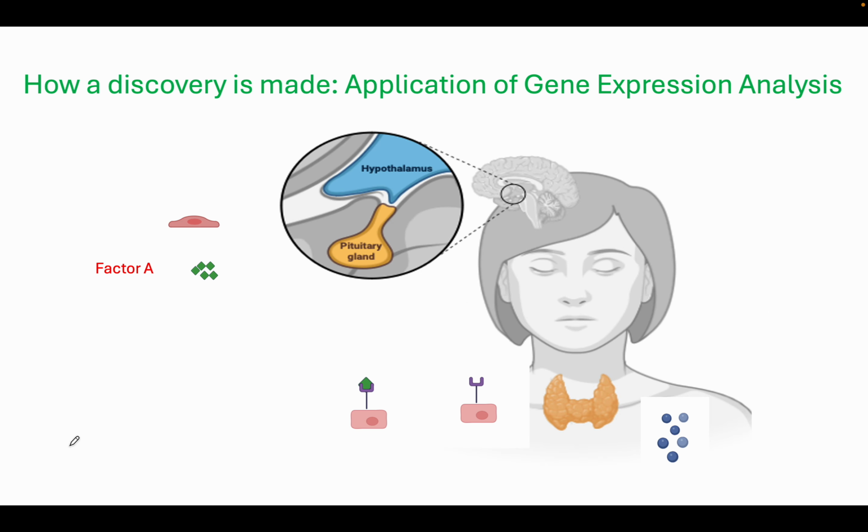Okay, so how a discovery is made, I cannot say like that. Rather, I can say how an experiment is designed and how we can use gene expression analysis or quantitative PCR or real-time PCR, which are the same thing, for making a discovery or for designing an experiment. Okay, so first of all, we will go through the literature.